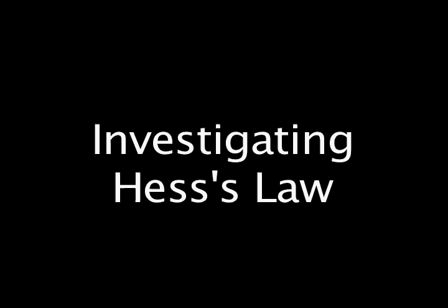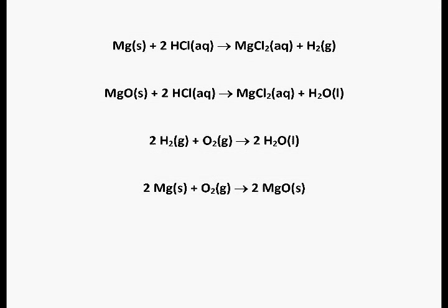This experiment is titled Investigating Hess's Law. In the first part of the experiment, we will look at the heat evolved between the reaction of magnesium with hydrochloric acid. In the second part of the experiment, we will look at the heat evolved from the reaction of magnesium oxide with hydrochloric acid. Knowing this, along with the heat evolved between the reaction of hydrogen and oxygen gas, we will be able to apply Hess's law to determine the heat of reaction for magnesium burning in oxygen.